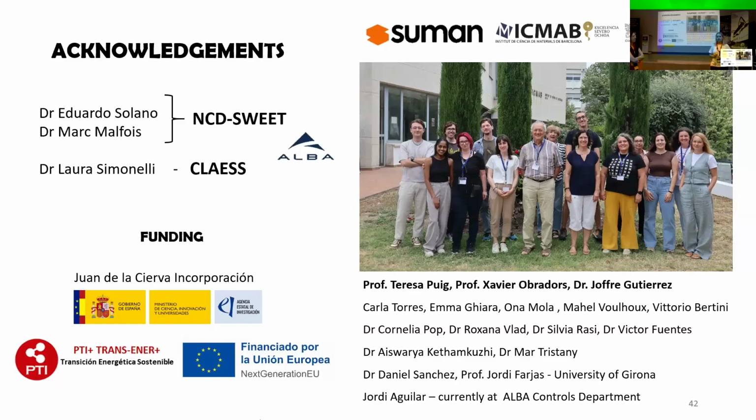Well, to correlate really GISAXS directly with the in-situ XRD is not really possible because we use different concentrations of the samples. No, I don't mean that. I mean, you need a certain number of unit cells before you get a diffraction peak, right? So how? We'll have to think about it. I don't know. Have any idea of?